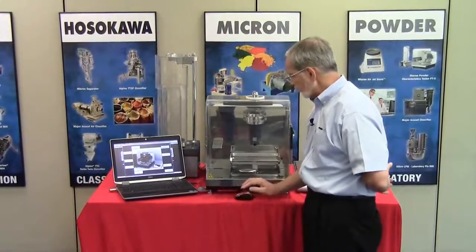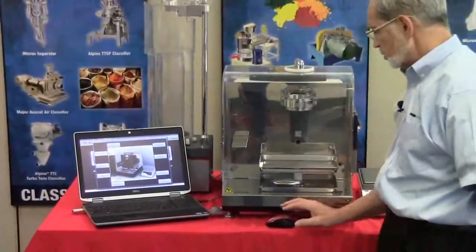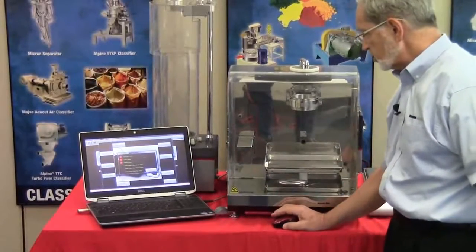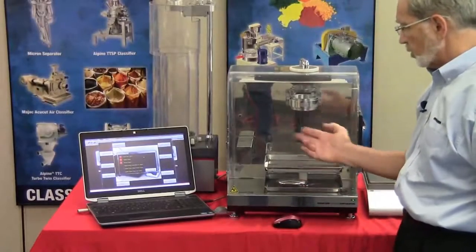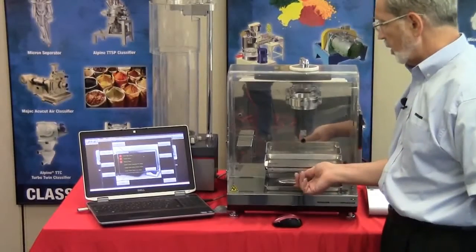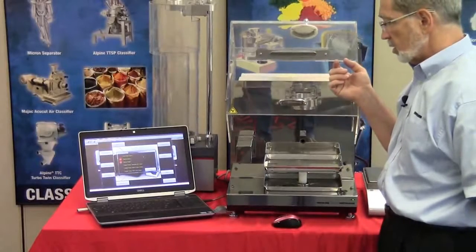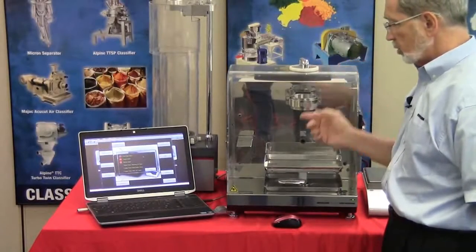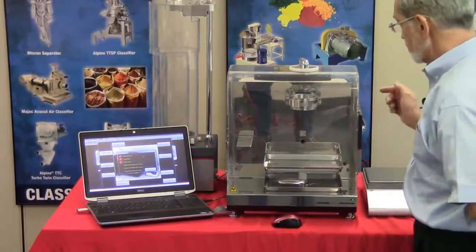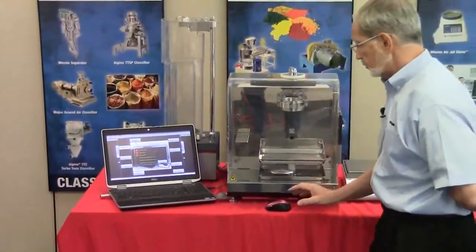Idle start, or start idle run, is another where we can flash the lights. That gives you an idea that we've got communication again. And then the various sensor settings. We have the tapping sensor, which we've already proved. We have the shocking sensor, which we didn't go through the exercise, but it does function. And now watch when I open the door. The indicator shuts down, and then we allow the door to close. Notice I let the door close independently on its own. Do not force it. There is a guide belt in here that if you do force it, you'll damage the belt.